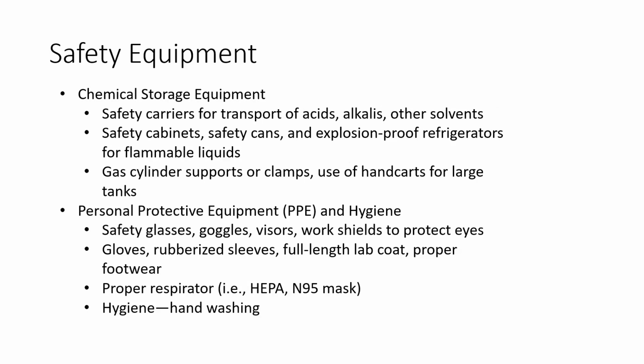Chemical storage equipment. So they're safety carriers for the transport of acids, alkalis, or other solvents. Safety cabinets, safety cans, and explosion-proof refrigerators for flammable liquids. Gas cylinder supports or clamps, the use of hand carts for large tanks.